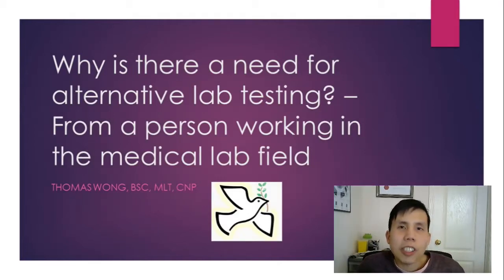I'm a certified nutritional practitioner and medical laboratory technologist. In this video series, I'll share with you what I do in the medical lab as a medical laboratory technologist, and how I gain insight that medical lab testing alone may not be sufficient in finding the actual root cause of a health concern, and that we should look at additional lab testing such as live cell microscopy, which may be useful.